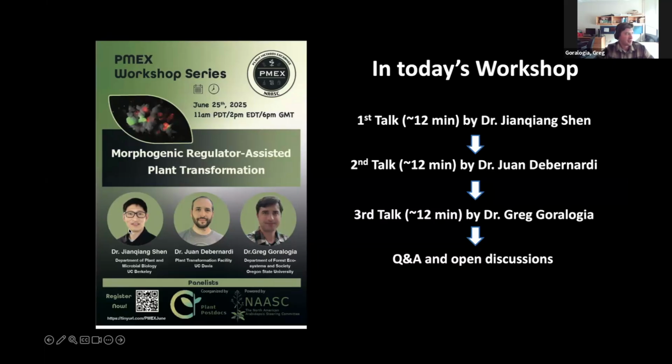You can try to do things like blend rather than wound them to try and increase your throughput. But the sad reality is it's still pretty low throughput. And so that's why I mentioned that it's important to just try things and look for qualitative effects first, because some of these are going to be really effective and they're great tools in the toolbox, but you have to do the hard work of putting this through the pipeline and figuring it out.